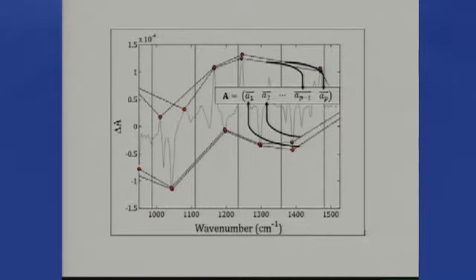So anyway, basically what we did before was to pick the maximum and the minimum in each of the 64 regions of the spectrum. Now what we're doing is taking every point. In this particular case, there's just the two neighboring points shown, showing how the derivative changes.